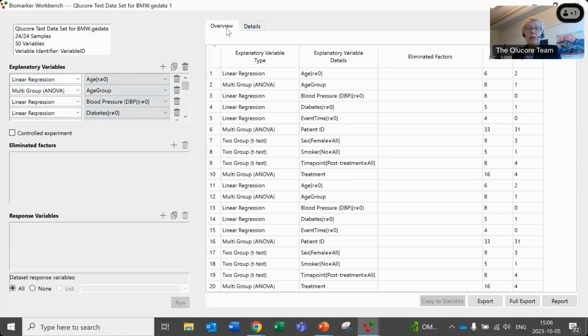And then we have the overview here, where we see how many variables or genes I find that have a Q value below 0.05. And here you see that the strongest signal here, for some reason I pressed this icon twice, so I get the results twice here.